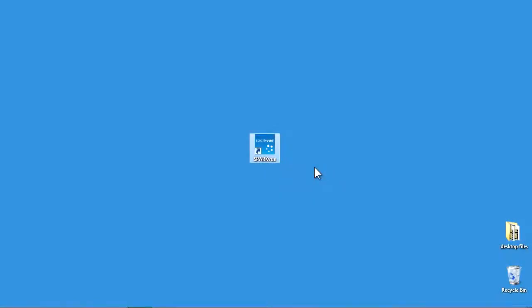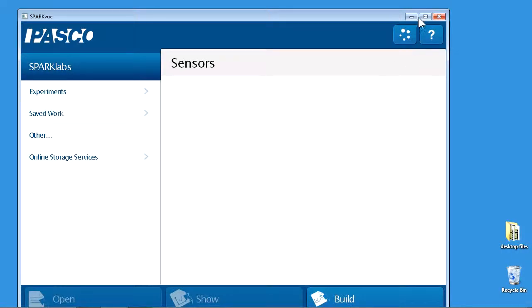Welcome to this overview of SPARKVue software from PASCO Scientific. In this series of movies, I'll be demonstrating some of the key features of SPARKVue version 2, our latest release. SPARKVue 2 is a free update from SPARKVue 1. I launched SPARKVue 2 on my Windows computer.